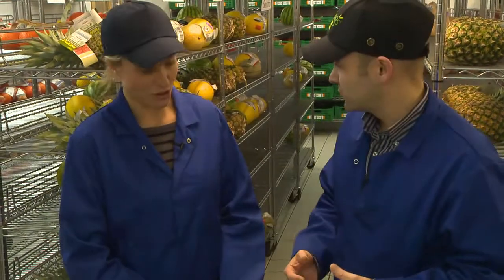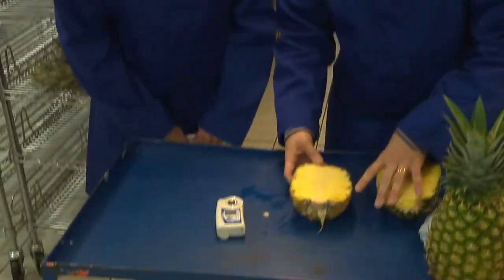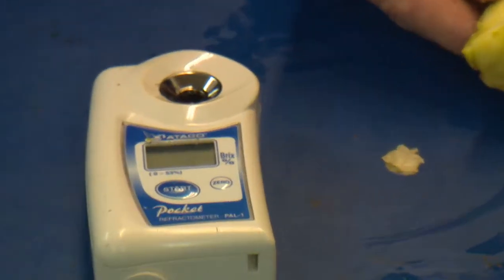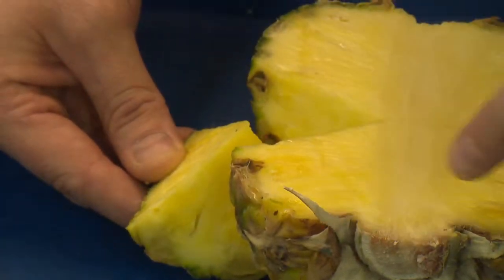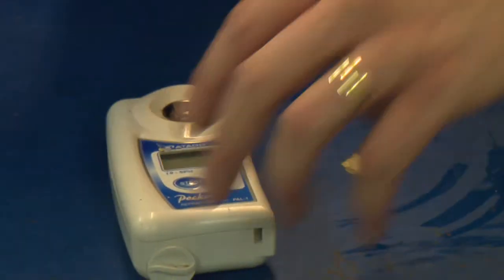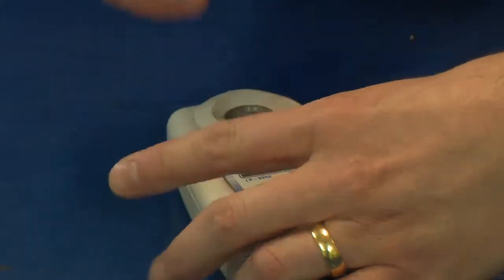So I'll just show you how we use this. We take a section out of the pineapple. It has to be in the middle of the pineapple because the sugars will be different up and down the pineapple. This is the sweetest part here, so we take it from the middle — that's the most representative point to take it from. Then we squeeze in some juice.